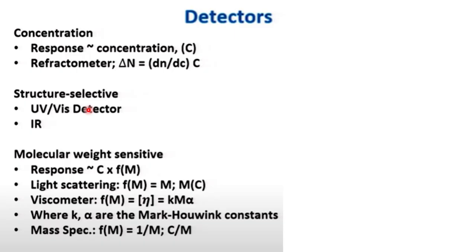Molecular weight sensitive detector: light scattering. Through a light scattering detector, you can directly check the molecular weight or size, and viscosity.